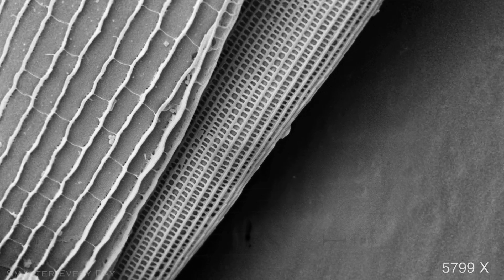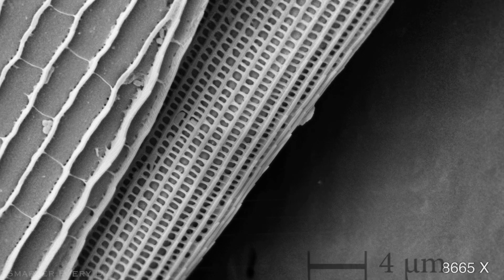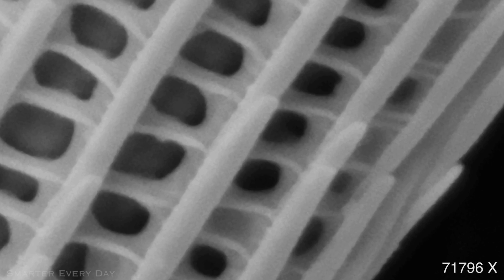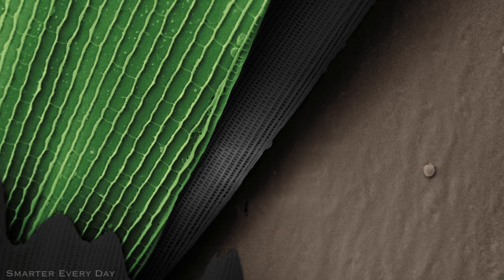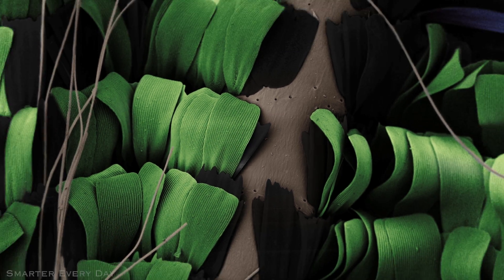Check it out. You can see that these two butterfly scales right next to each other have different textures. The little holes in the one on the right are less than a micron across. I've heard that butterfly wings are colored by holes in them, so you'd think that the one on the right is colored. But I did a little cross check and figured out that the ones with the open lattice structure are actually black. Because SEM uses electrons instead of light, it can't provide color. So it's common for scientists to create false color images to help people understand what they're looking at.